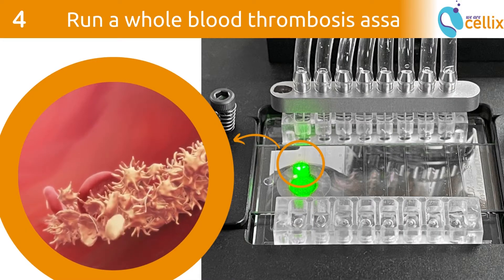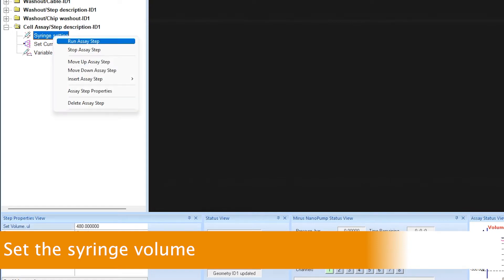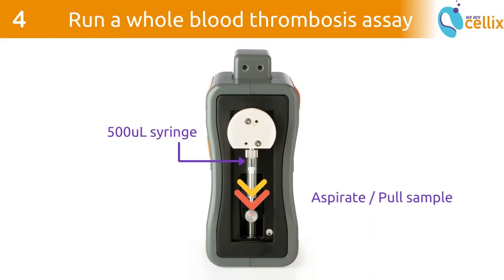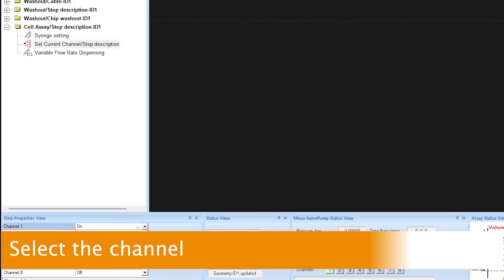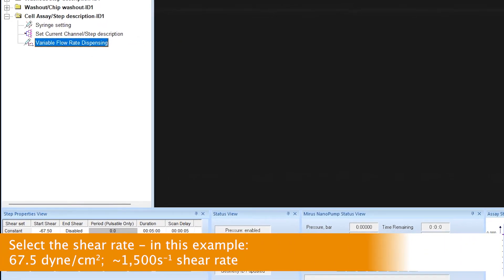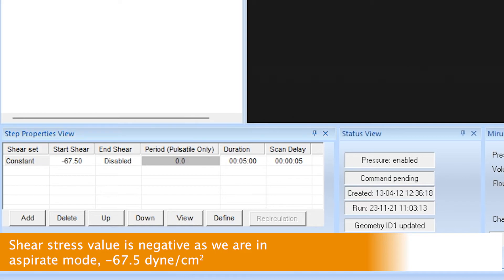This chapter demonstrates how to run a whole blood thrombosis assay. To input the settings for the assay, first set the syringe volume. We are using a 500 microliter syringe in aspirate mode, meaning we are pulling the sample through the chip. To ensure a good volume that can be pulled without refilling the syringe, we set the syringe to 480 microliters — meaning the syringe is almost empty and can pull 480 microliters before refilling. Second, select the channel you will use and close all other channels. Finally, set the shear rate. In this example, we are running a shear stress of 67.5 dynes per square centimetre or a shear rate of 1500 per second.